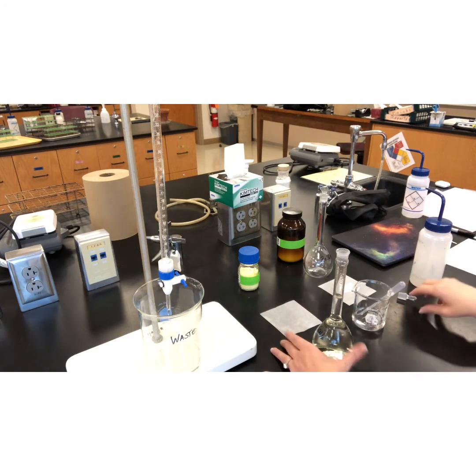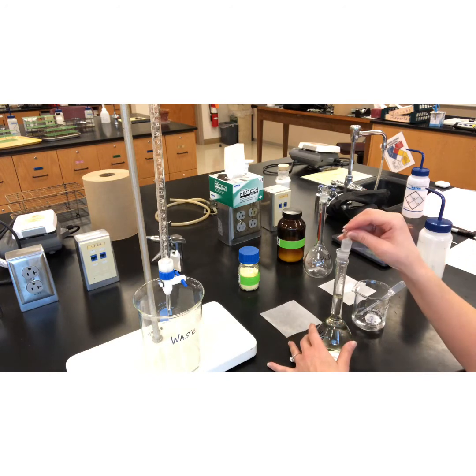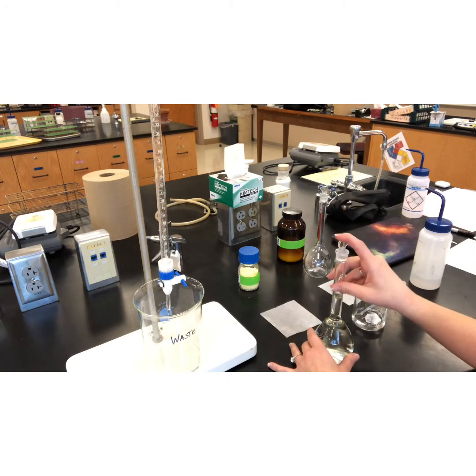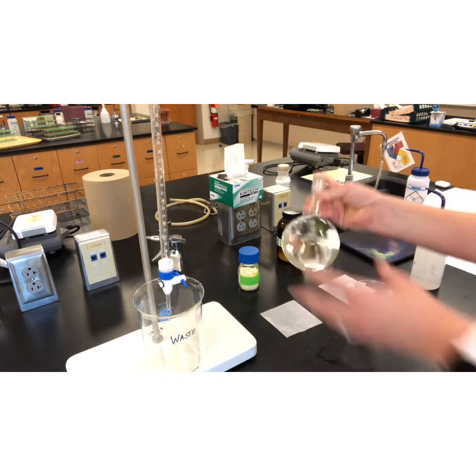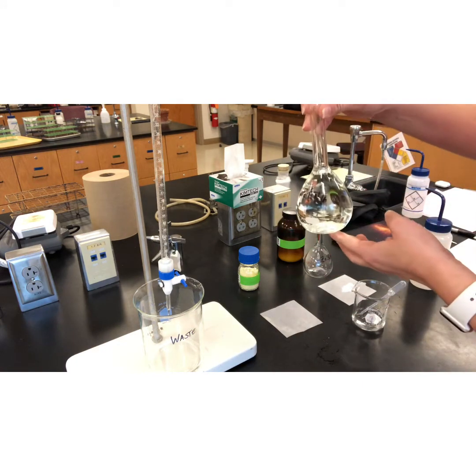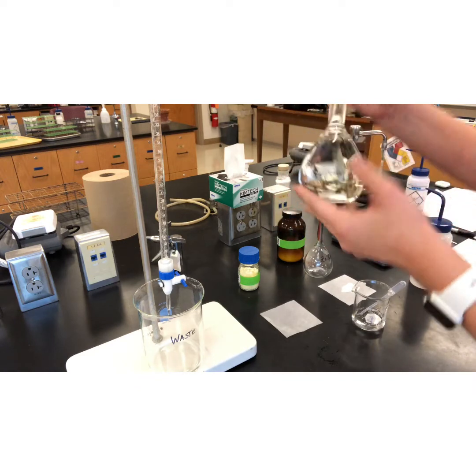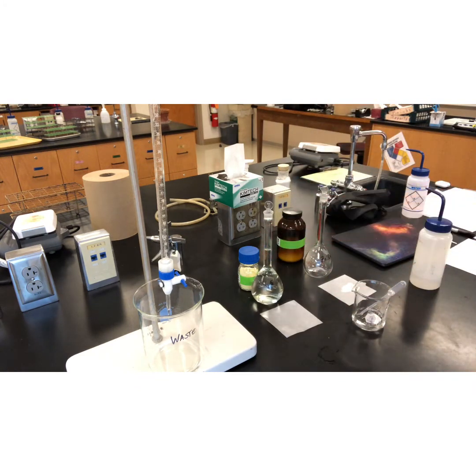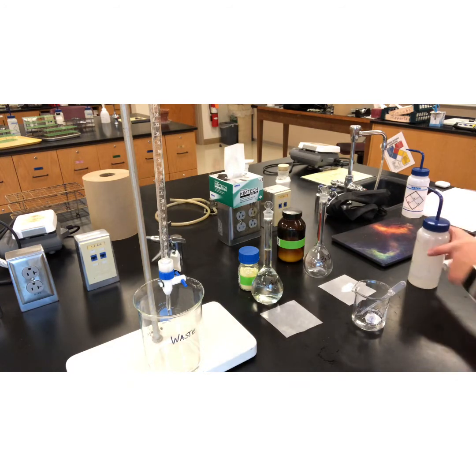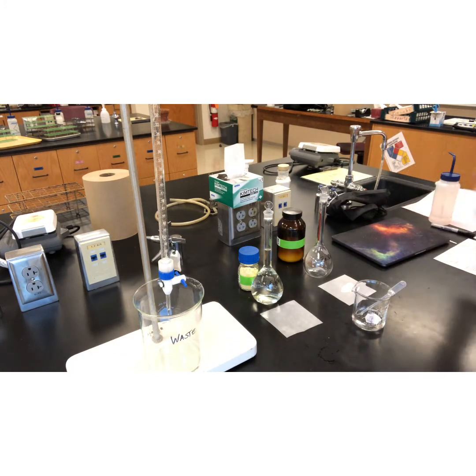Nailed it. Looks good. All right, so I'm going to put my stopper in, and I can go ahead and mix my solution up, making sure my solution is thoroughly mixed. And that is my first solution of my potassium ferrocyanate solution.